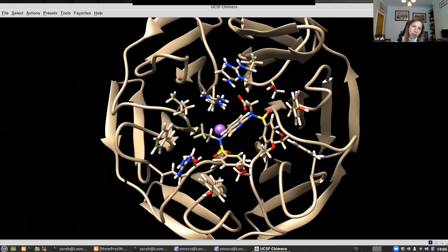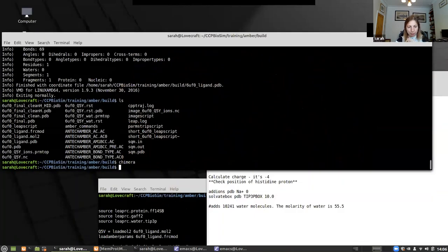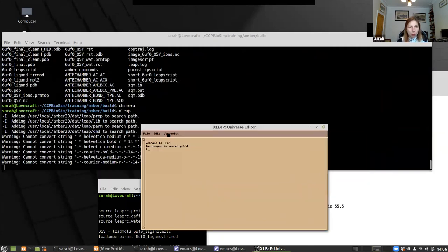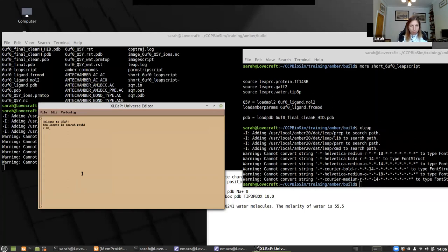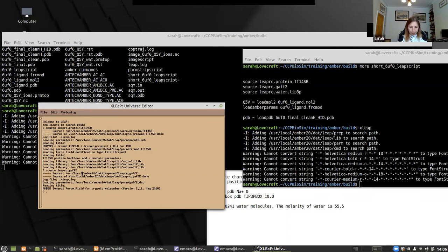We've protonated our structure in Chimera, saved the PDB file, and now we're going to start x-leap. Loading our force fields: source leaprc.protein.ff14SB for the protein force field, source leaprc.gaff2 for GAFF.